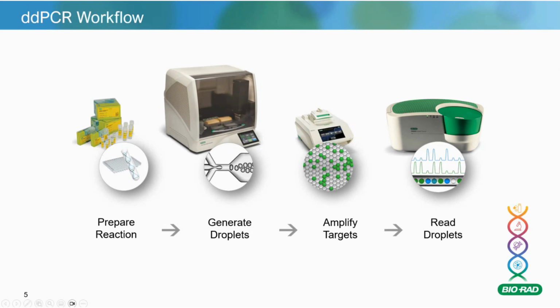So everyone should be fairly familiar with the first step, which is preparing a reaction. What goes into a real-time PCR reaction? Well, you've got your nucleic acid, or your sample of interest. You've got your primers that are specific to the amplicon that you're looking at targeting. And you've got probes potentially if you're using probe-based chemistry, or if you're not using probe-based chemistry, you can use an EvaGreen-based dye, which is similar to SYBR Green.